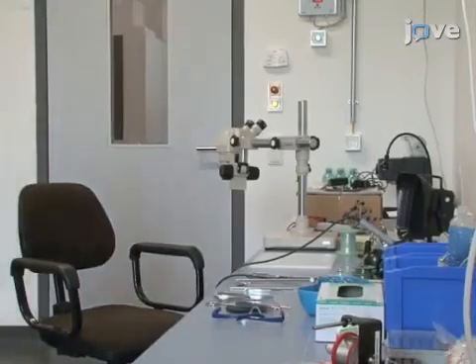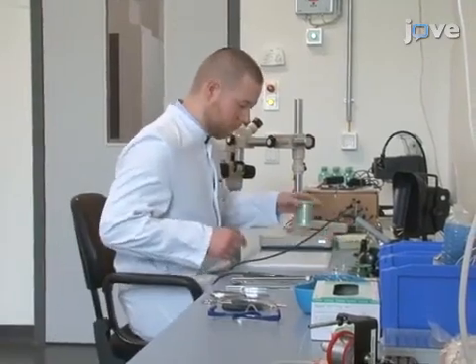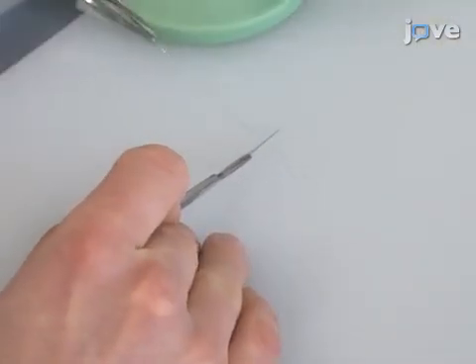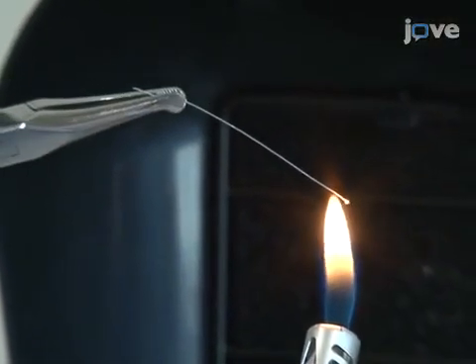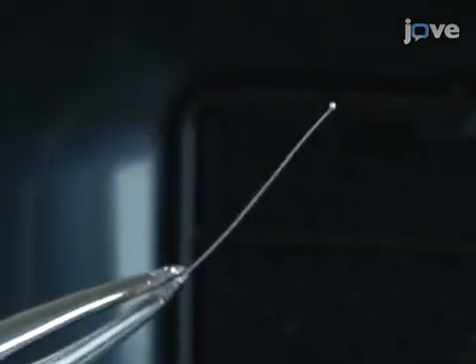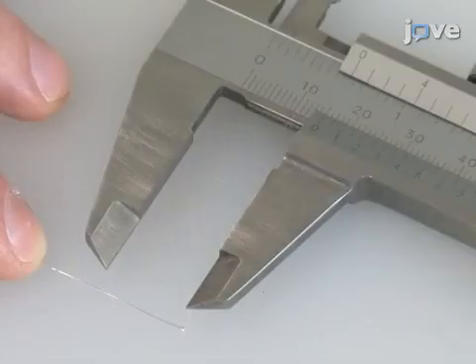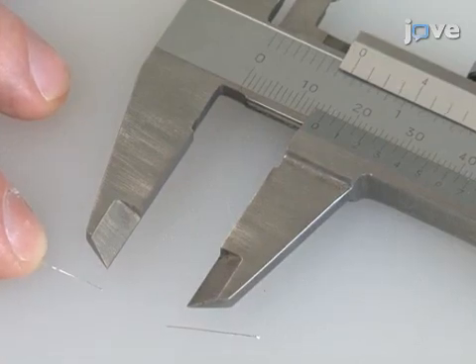To begin this procedure, prepare a 5 cm length of silver wire with a diameter of 200 µm and remove any coating if necessary. Next, hold the wire tip downwards in a flame until the tip starts to melt and forms a ball with a diameter of 1 mm. Then, cut off the electrode to a total length of 15 mm from the beginning of the ball-shaped tip to the wire end.